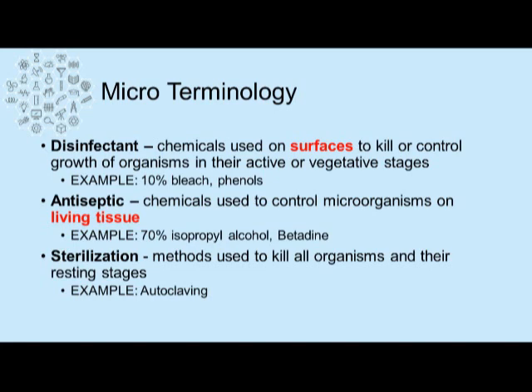Because of the innate risk of working in a microbiology department, it becomes important to keep your working environment free of pathogenic organisms for you and your co-workers' personal safety. To do this, we use cleaning agents such as disinfectants, which are chemicals applied to surfaces to kill or control the growth of organisms in their active or vegetative stages. An example is 10% bleach or phenols, which are typically made up daily as part of routine maintenance.